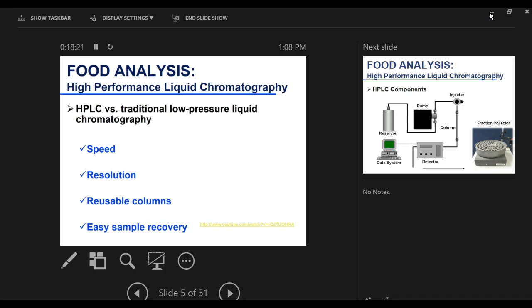Not all components absorb UV light, and those that do have different responses, so these factors need to be considered when choosing a suitable detector. There are a range of different detectors available, which may be used for HPLC. These include MS, which passes the flow coming out of the column into a mass spectrometer, thus obtaining information on the amount and molecular weight of the compound. Other detectors which you may have encountered include evaporative light scattering, charged aerosol, fluorescence, and conductivity detection.